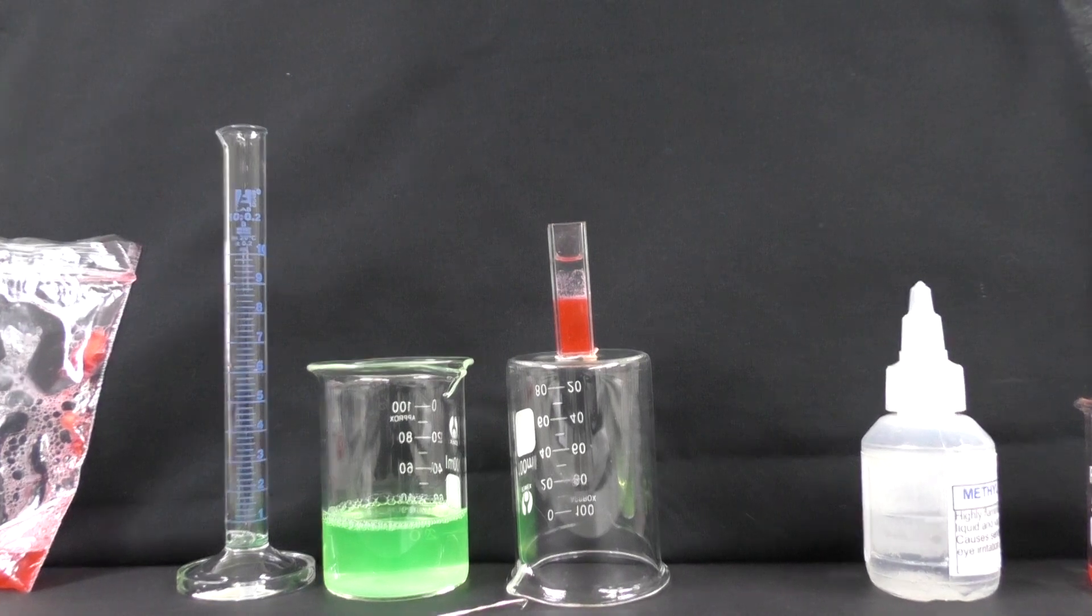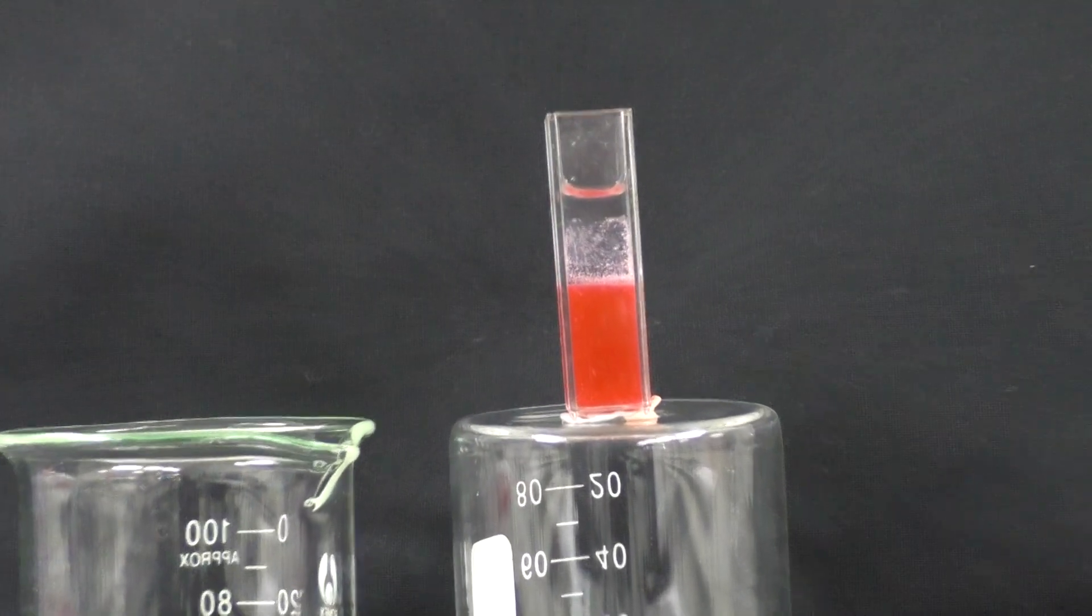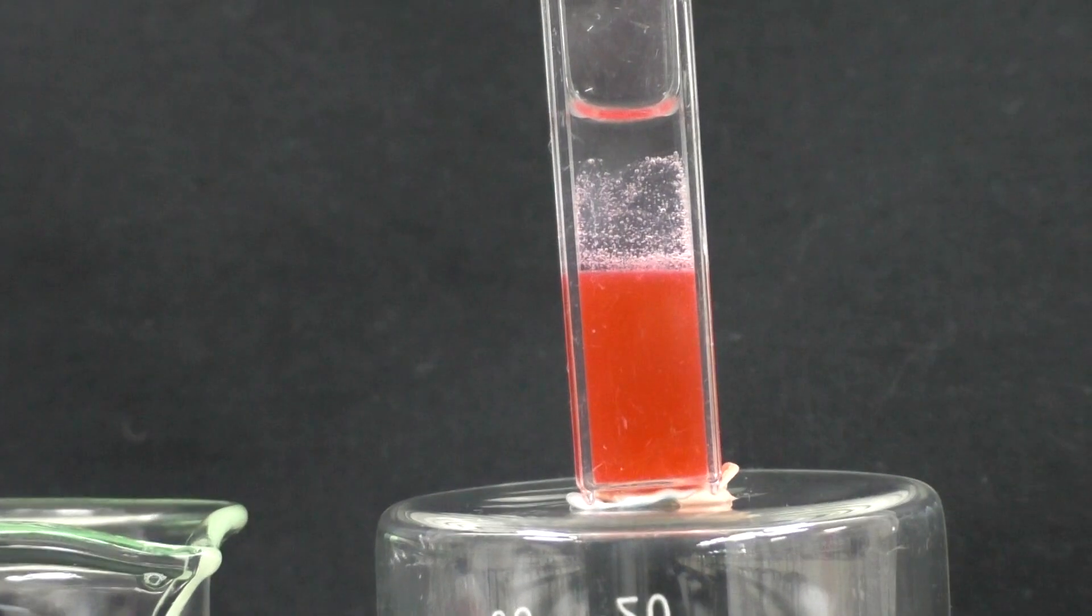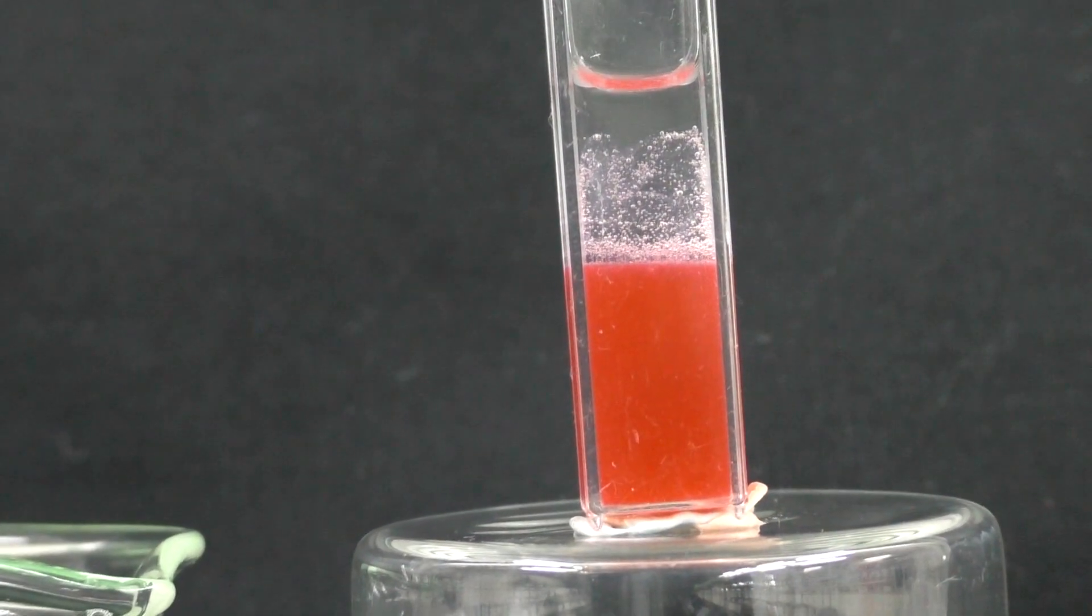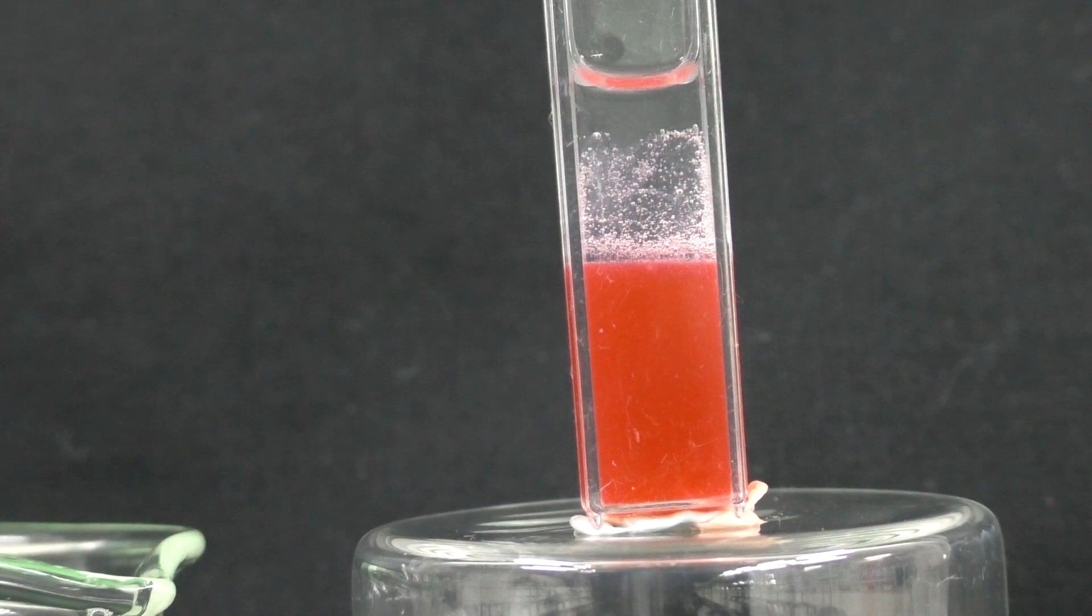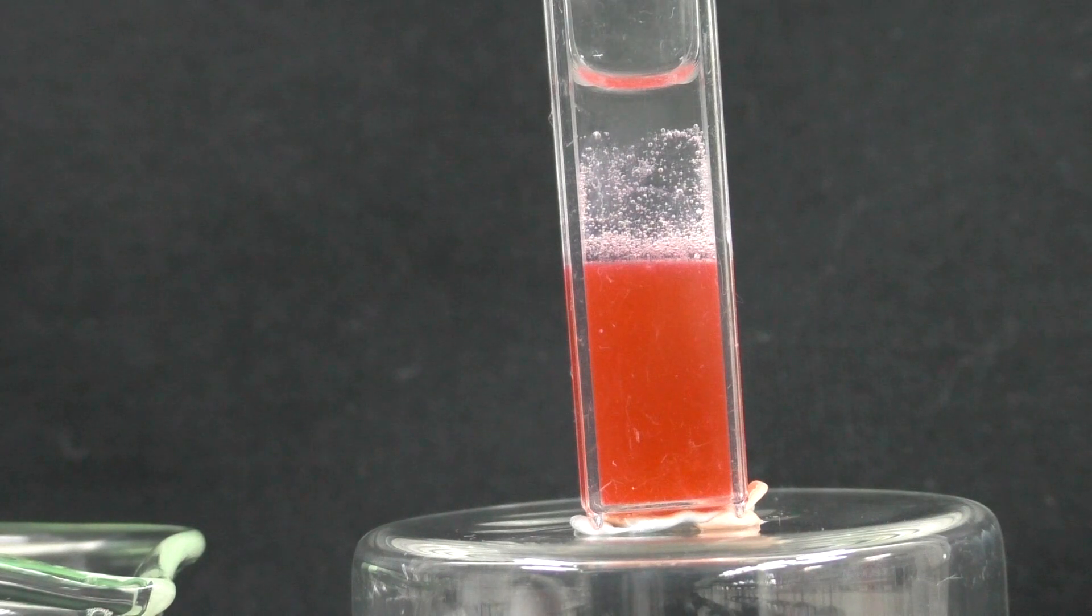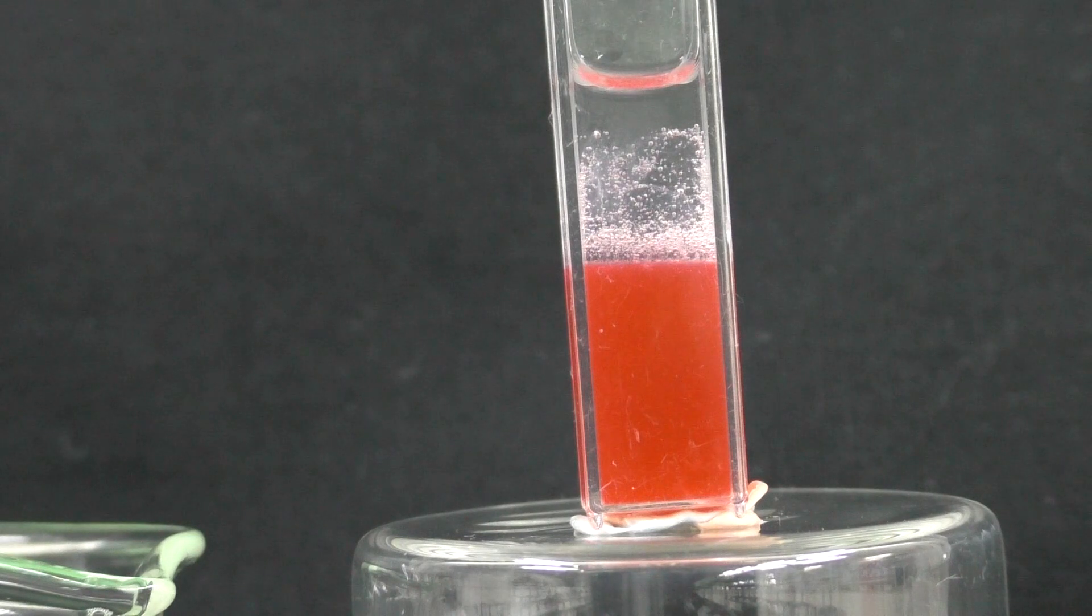So now you can see there's two layers. If we zoom that in a bit more, we can see the two layers. We've actually got the interface between the red and the clear layer. You can see there's some white stringy material. That will be our DNA.